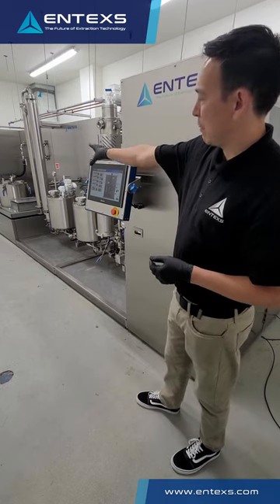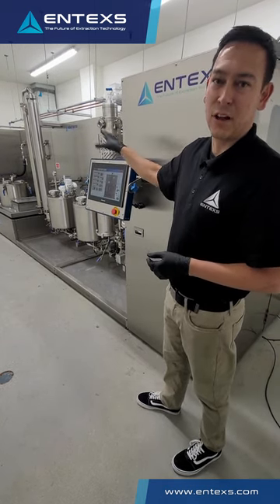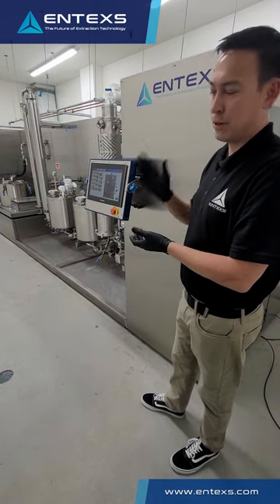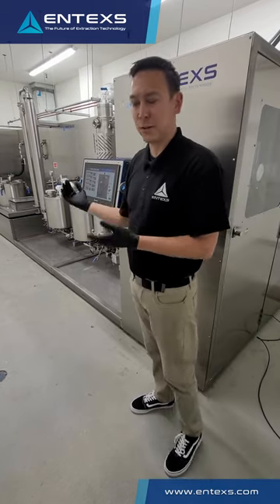This features biomass extraction, evaporation, and distillation all in line, and allows you to process fully closed loop from biomass input to a final product output. I'm going to showcase some of the features of this equipment.